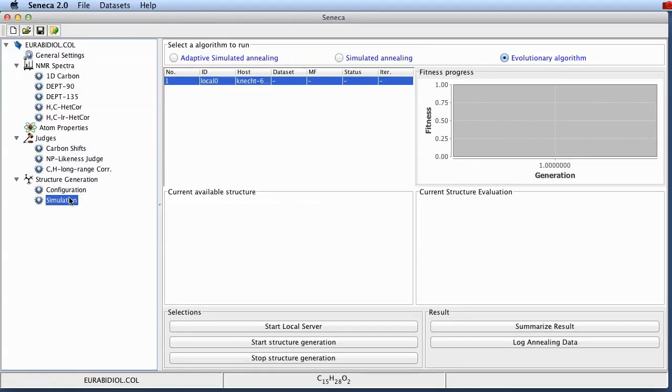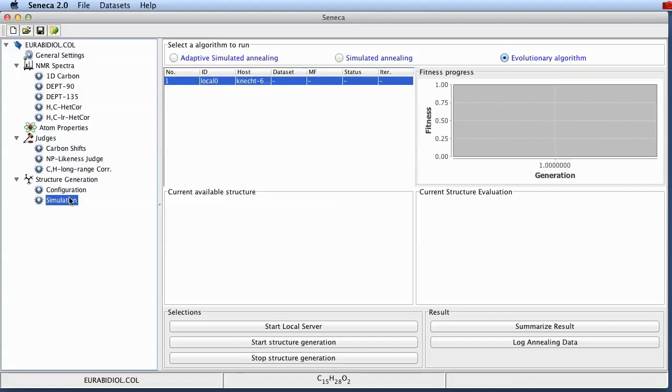So Seneca performs a stochastic search of constitution space looking for an optimal solution for this structure elucidation problem. But it cannot guarantee in a single run that it will find the global optimum. This is why this type of stochastic searches is usually run multiple times either in parallel or sequentially. And people would then collect the results and perform the analysis on the collected results.